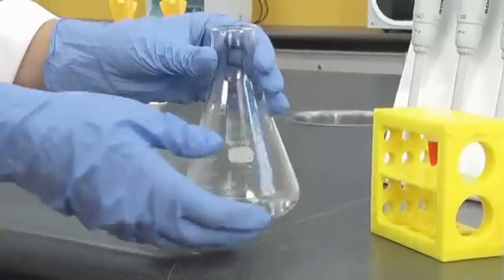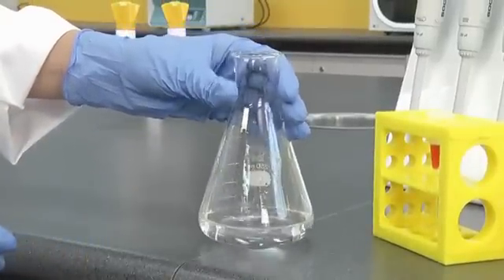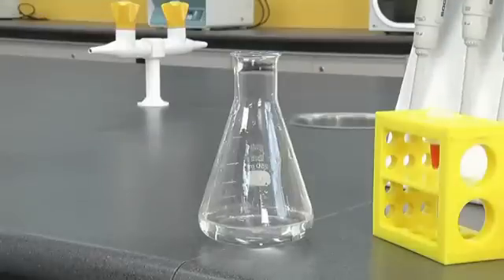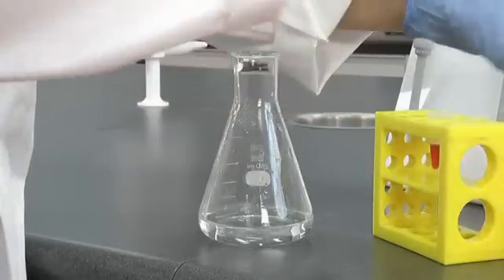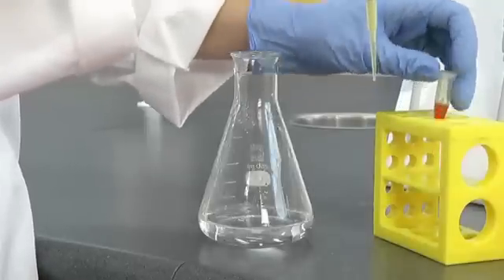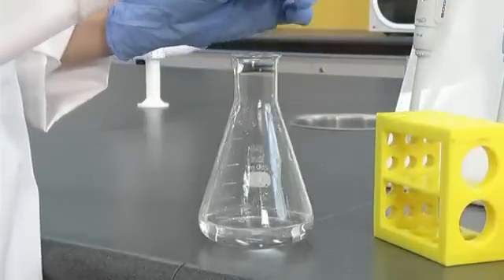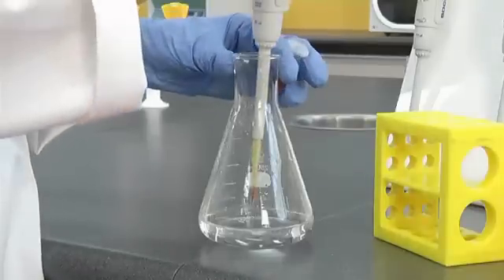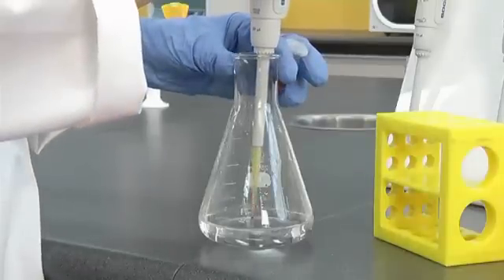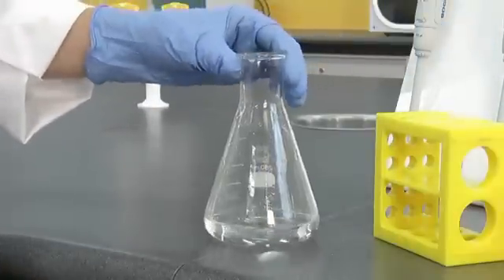Let the agarose cool to approximately 60 degrees. As a rough guide, this is the temperature where you can hold the flask comfortably while wearing your latex or nitrile gloves. You can speed up the cooling by holding the flask under running water. At this stage you can add your fluorescent dye if required. Remember to swirl the flask.